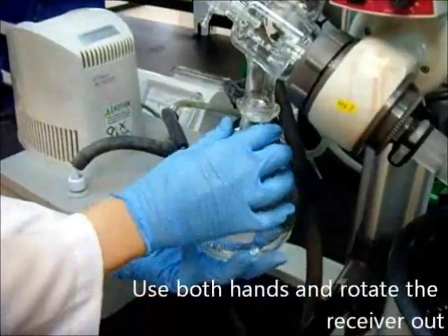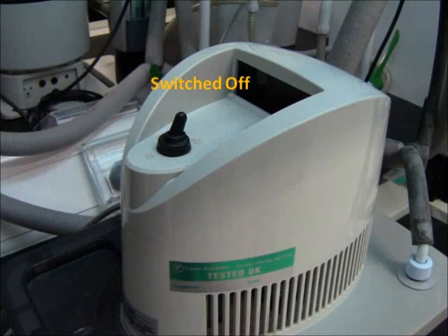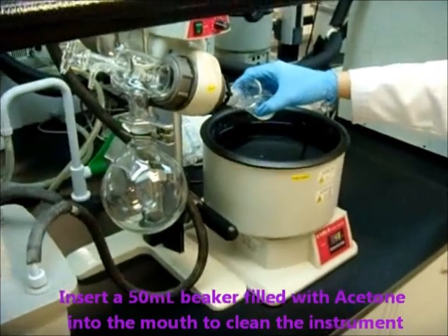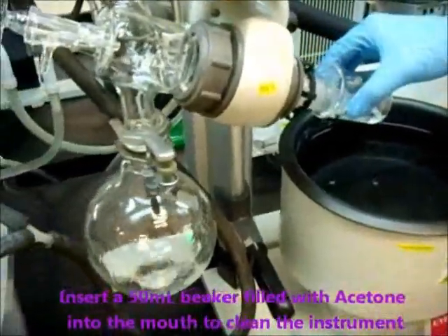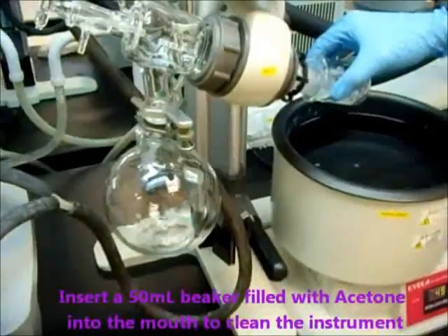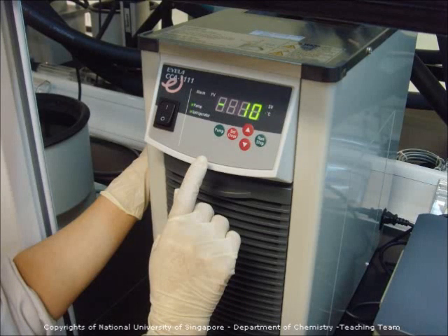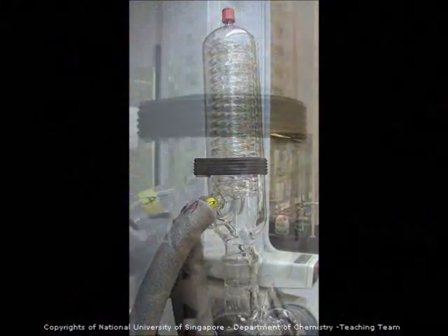Use both hands to rotate the receiver out. Turn on the aspirator. Insert a 50 ml beaker filled with acetone into the mouth to clean the instrument. Check that the chiller temperature is maintained at negative 10 degrees Celsius, and confirm that the condenser is running.